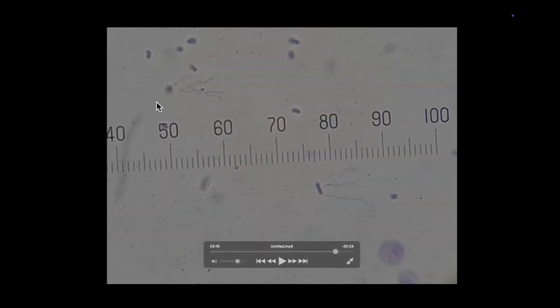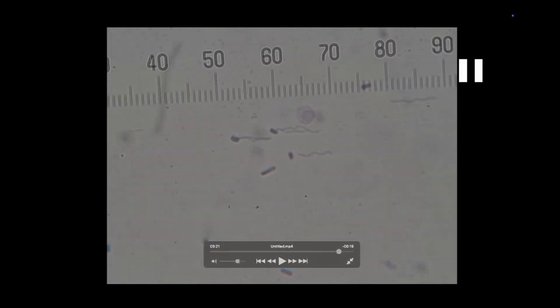For this slide, you can see the flagella here with the bacteria and also the flagella here. For this one, you can see the bacteria with the flagella.